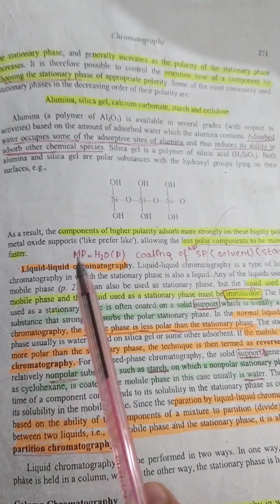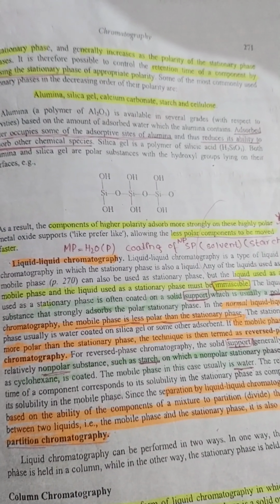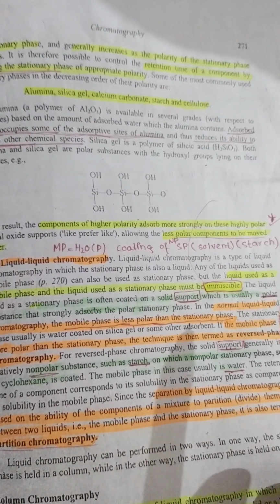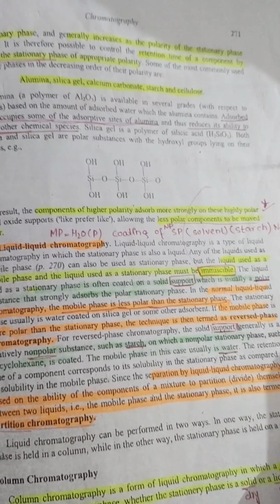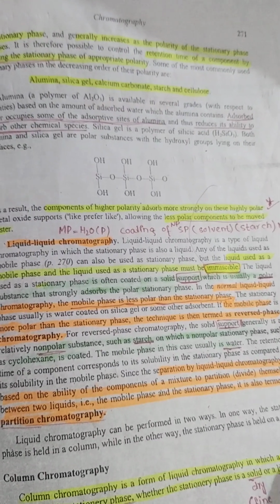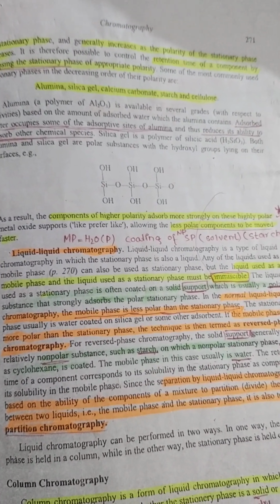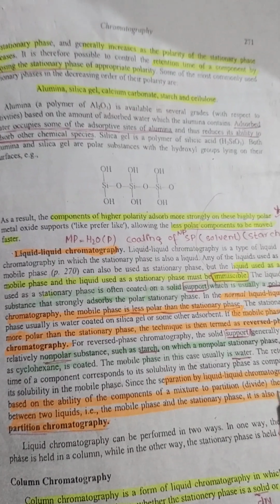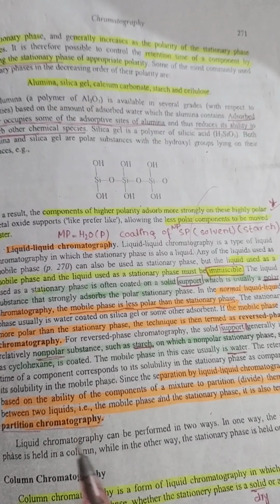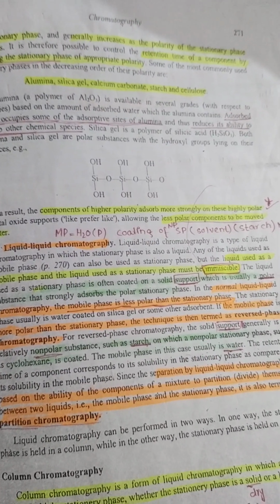Now next we discuss liquid chromatography. In liquid chromatography, we categorize into two types: normal phase liquid chromatography and reverse phase chromatography. Here the stationary phase is also a liquid. The liquid we use in the stationary phase is immiscible with the mobile phase liquid, and the liquid phase is supported on a solid support, which is usually polar in normal phase liquid chromatography, and non-polar in reverse phase.